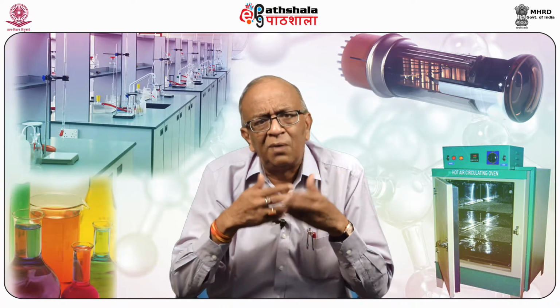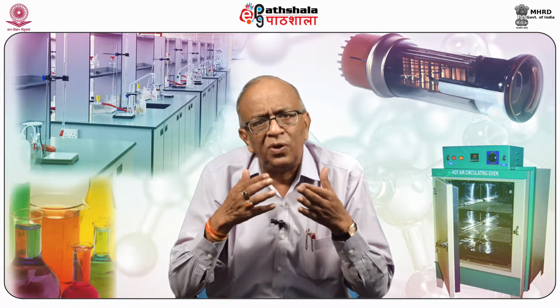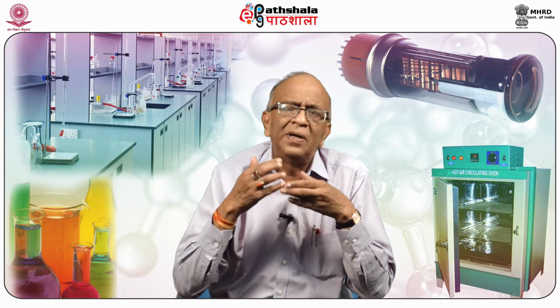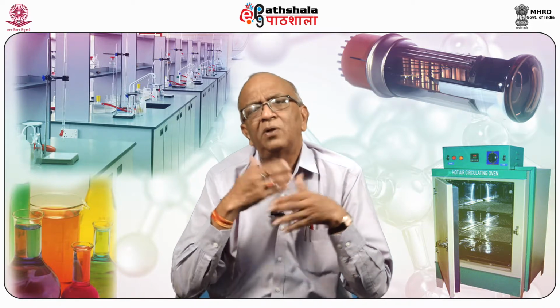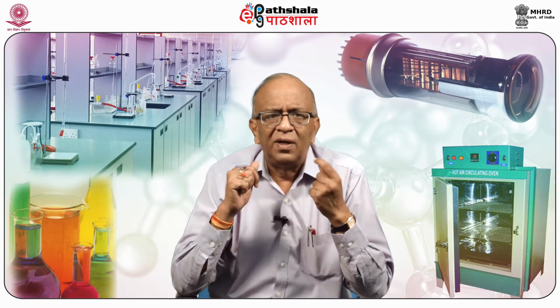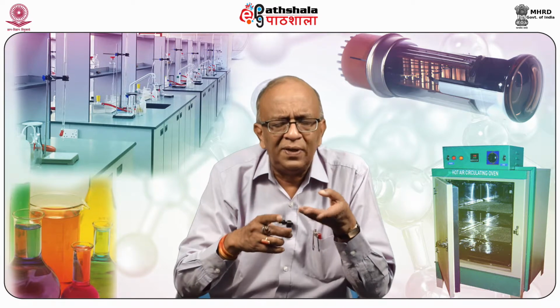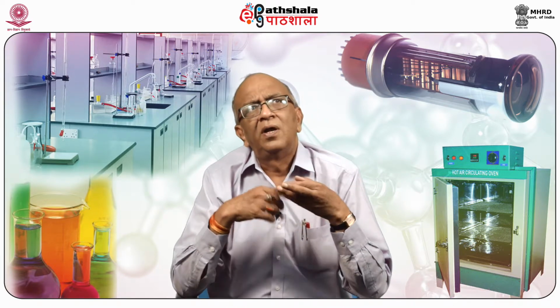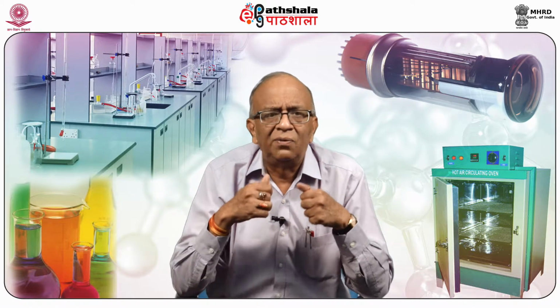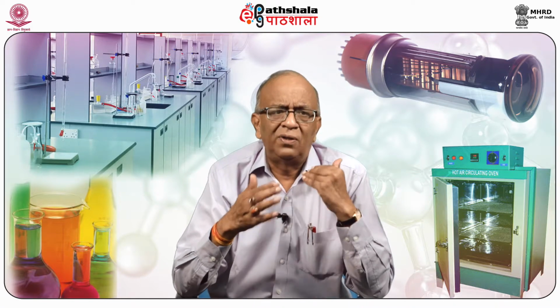The physical and chemical changes a sample undergoes when heated are characteristic of the material being examined. These are the characteristics for particular substances. As the boiling point is a characteristic of water, the melting point and the boiling point of benzene are also characteristic. If a substance has a boiling point of 100, you can say that the given substance may be water. So these are the characteristics for that substance.